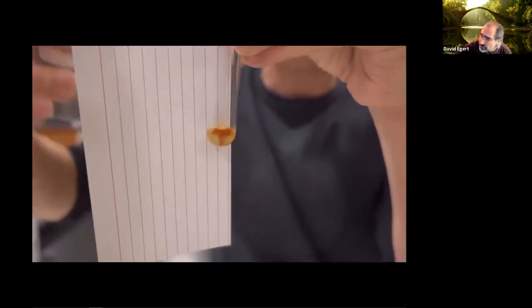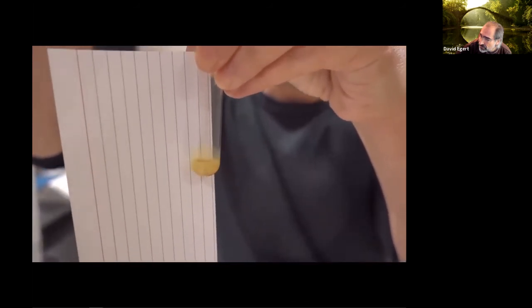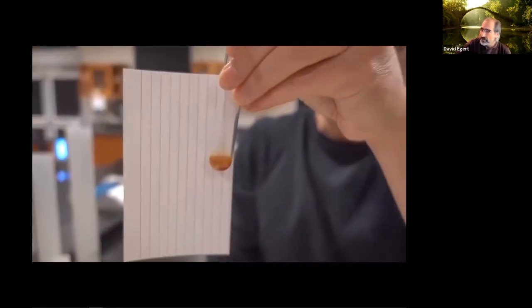Oh, it's not staying brown. 9, 10. Not quite yet. 11, 12. Ooh, it's almost there. 13. Probably give it one more. 14. That's brown. So 14.